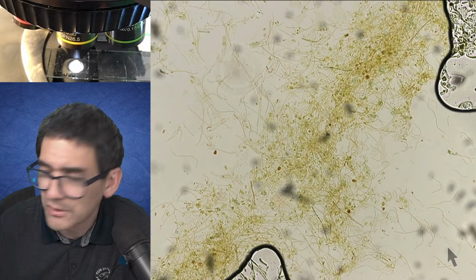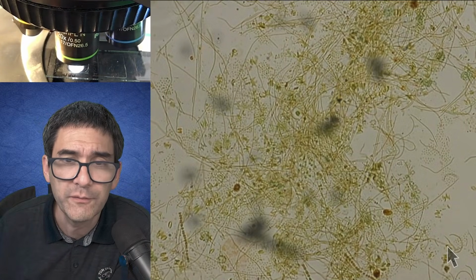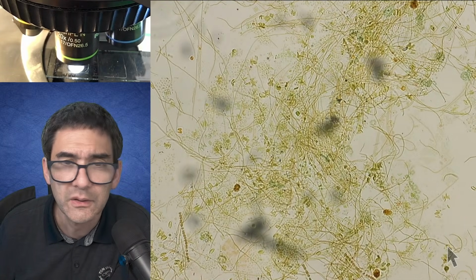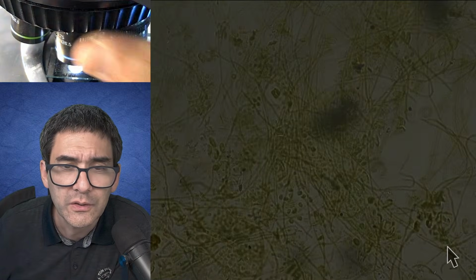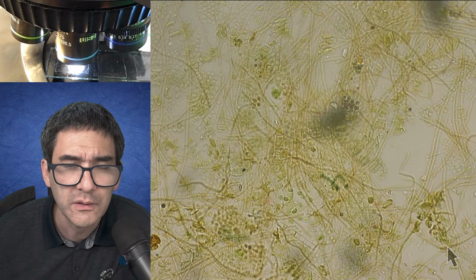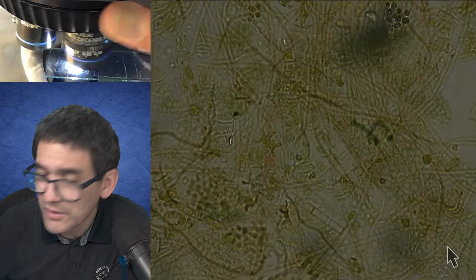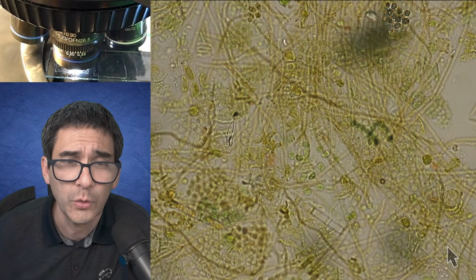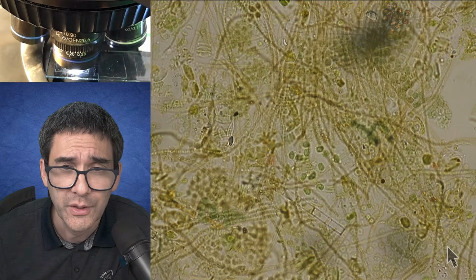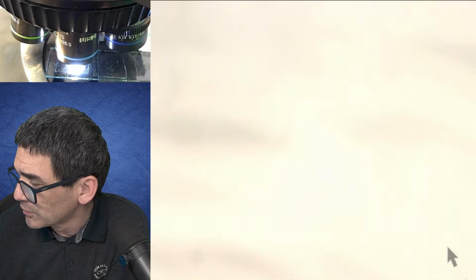Here it is. So let's go up with the magnification again. This, by the way, is again bright field, so no optical staining here. Let's go up yet further. Those string-like structures, many of them cyanobacteria. But if you remember how it looked 2 weeks ago with the fresh sample, no comparison. The fresh sample is so much nicer and better than this one. So this basically means that even here we have a little bit of a degrading of specimen quality.